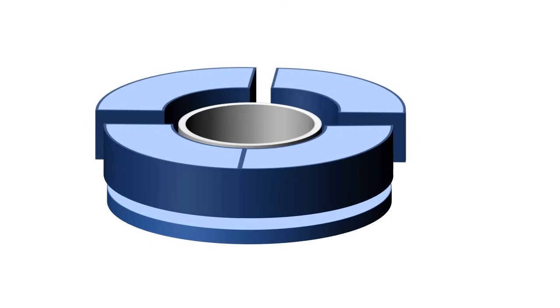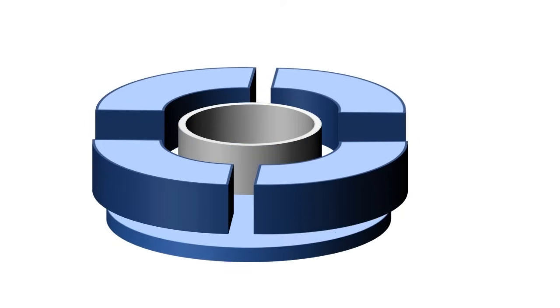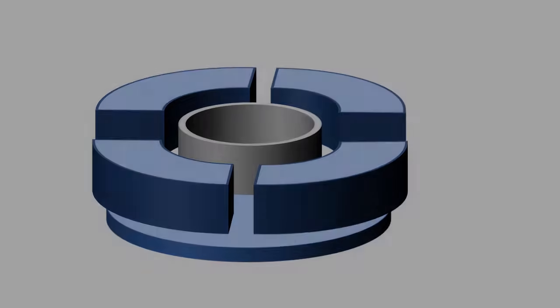Each of these five LED modules, the bottom disc as well as the four side modules, can be independently operated as well as swapped for different wavelengths.